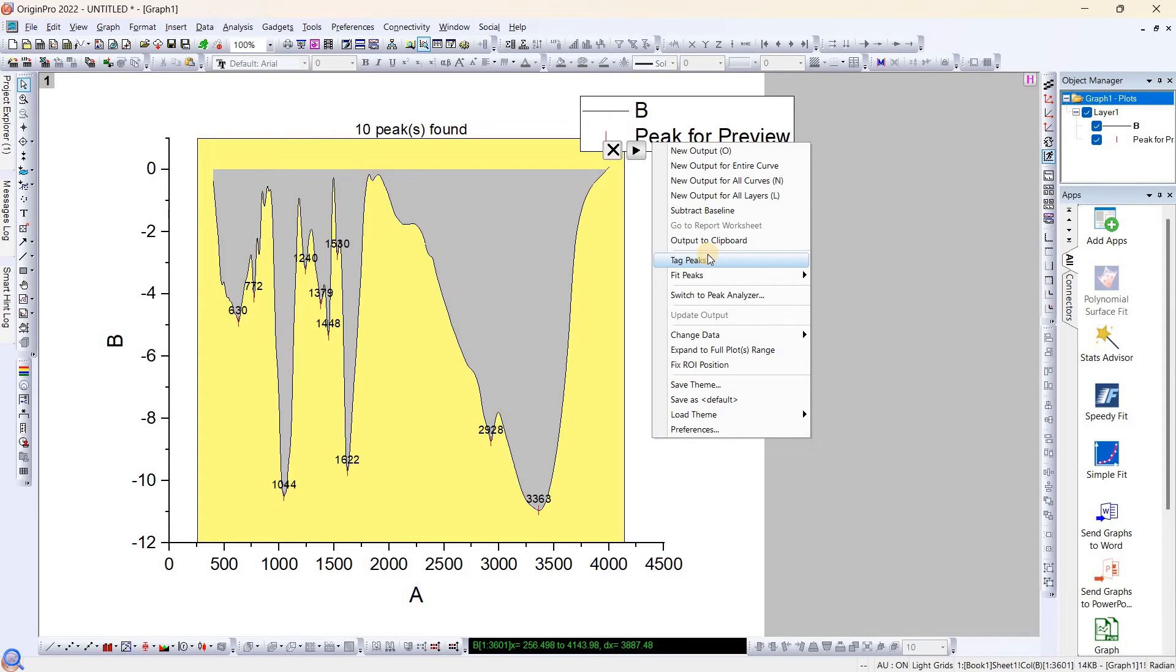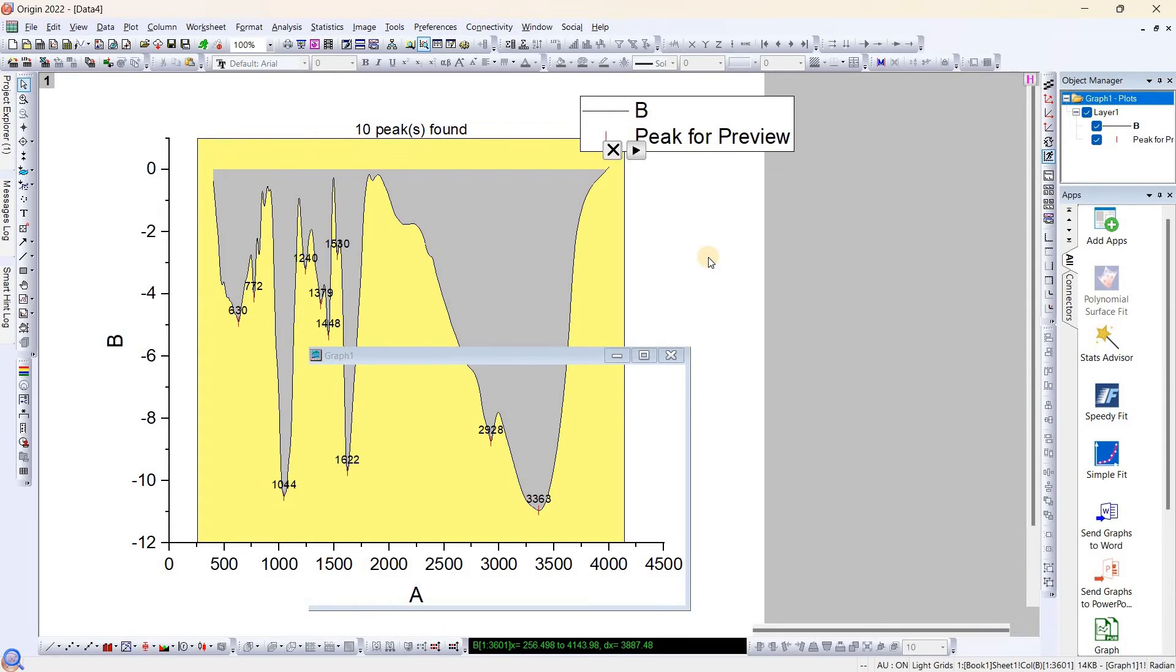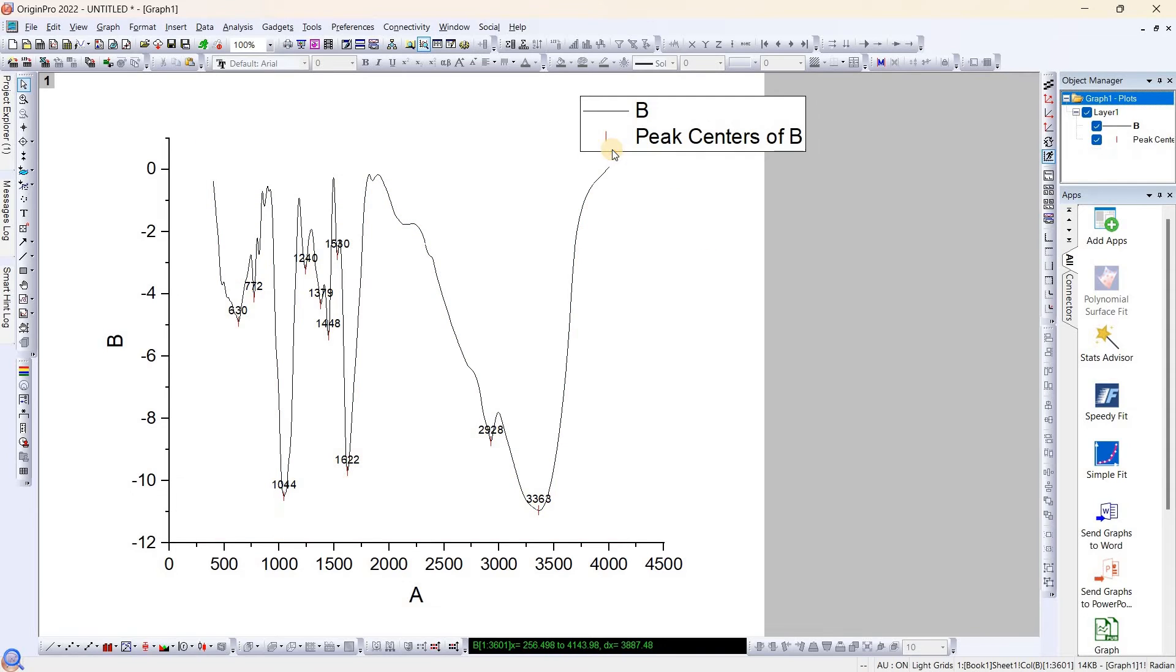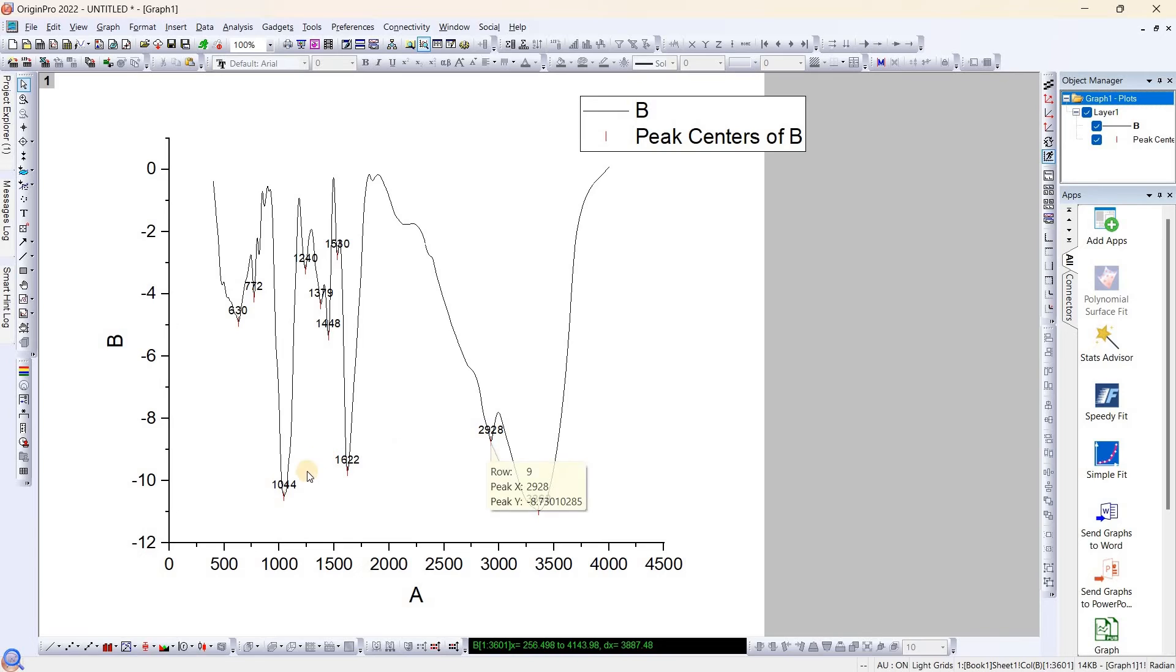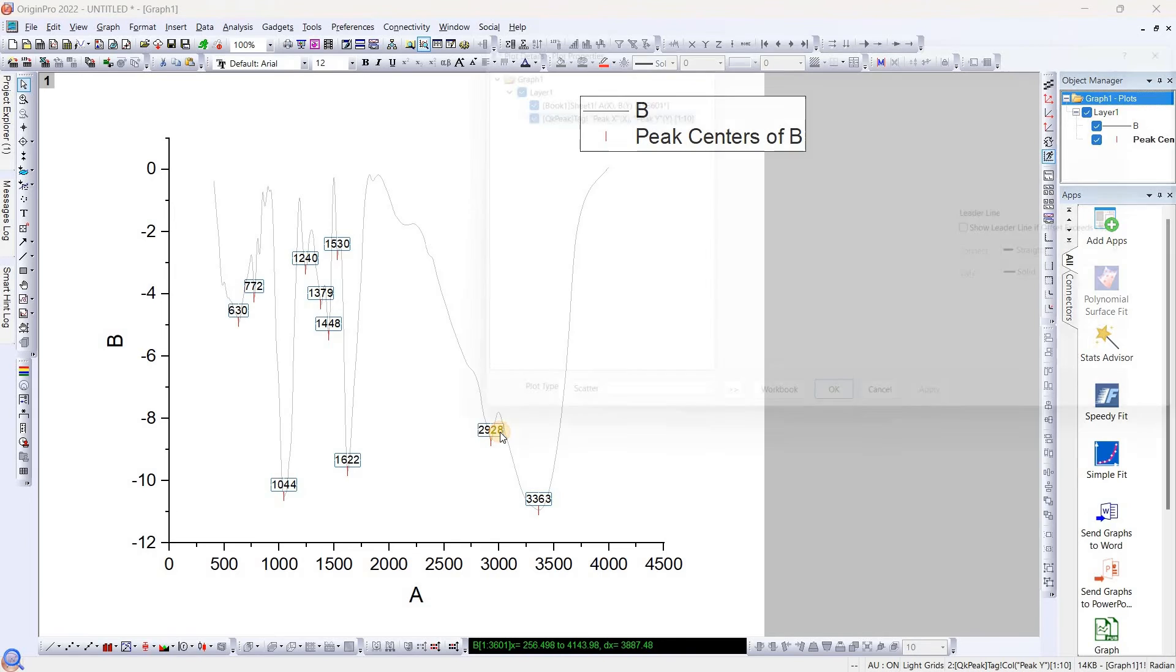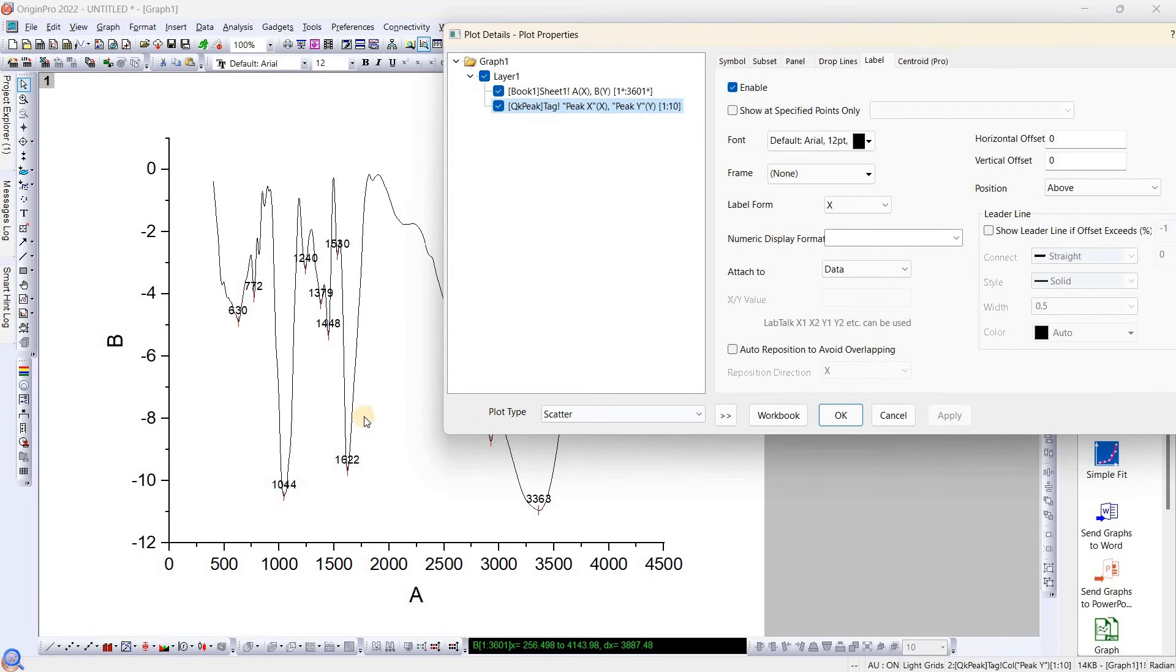Now you have to make sure that before canceling this, you need to tag the peak. Why? Because if you don't tag and simply cancel, all the peaks which you have found will disappear. So you need to tag this. Now once you tag, these all peaks are linked together, so you don't have to change anything individually.